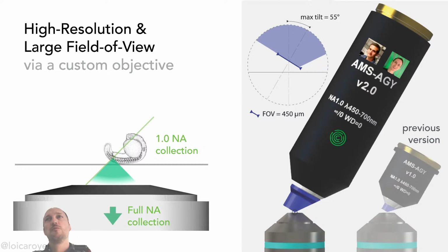What's important to understand here is that in many cases for biology, when you need to look at things that are very finely resolved, you need to be able to get to such NAs. That's very true for single cell imaging, but even for embryo scale imaging, we need to be able to see membranes, for example. We need to be able to resolve nuclei, especially to resolve that two nuclei are not one.